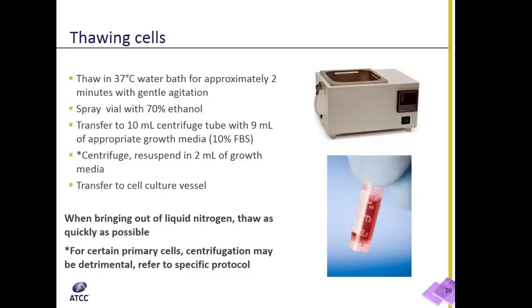Thanks, Kevin. First we're going to talk about thawing cells, then go into freezing down cells, and then talk a little bit about contamination and how to deal with it. So first, thawing cells.